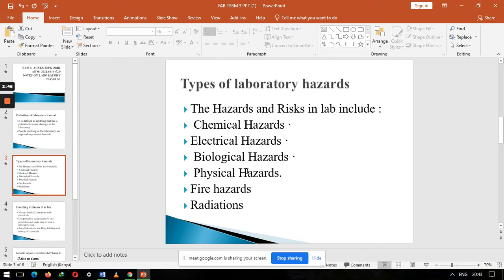We have biological hazards. Thank you. Any other, class? We have chemical hazards. Thank you, Oduol. We have electrical hazards.